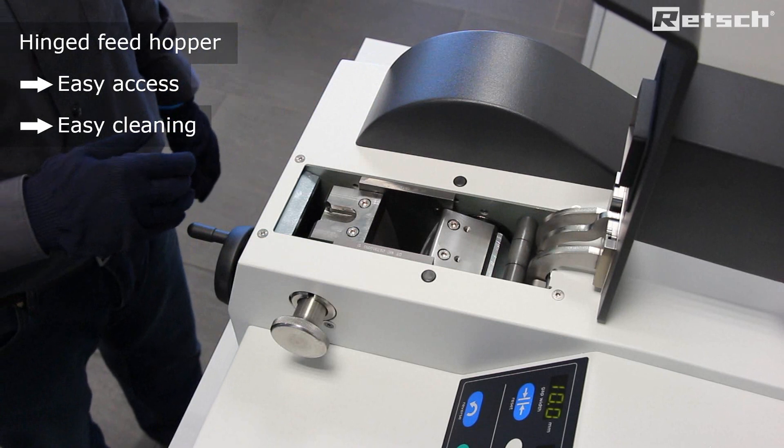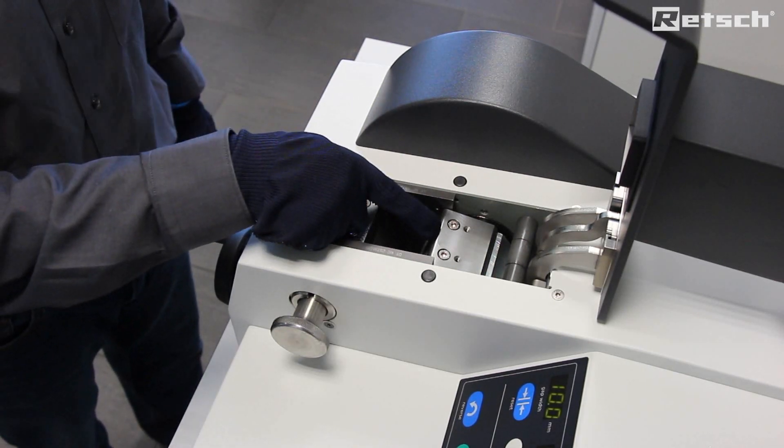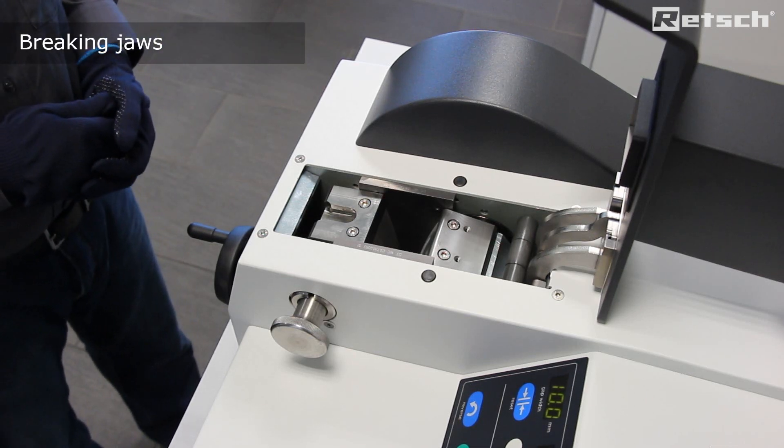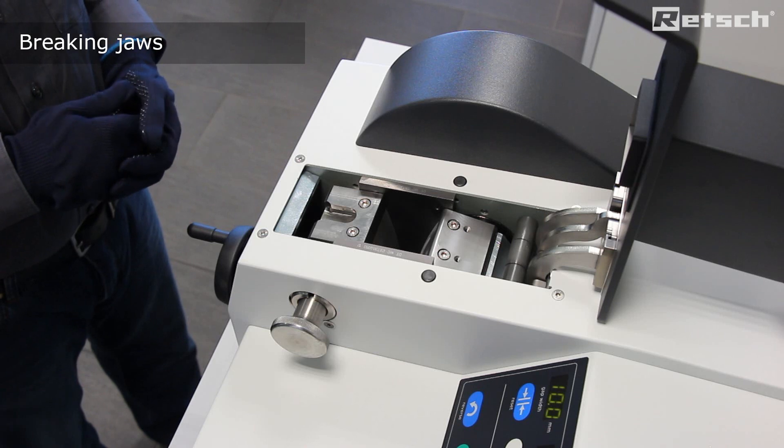Crushing of the sample material takes place between the fixed and the moving jaws. Such breaking jaws are available in five different materials to preserve sample neutrality.